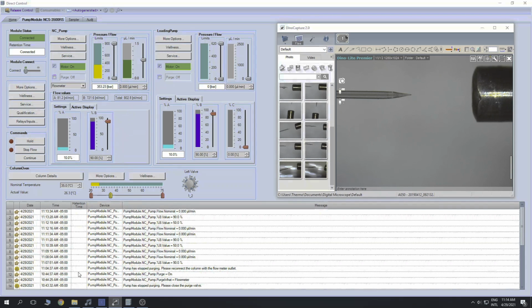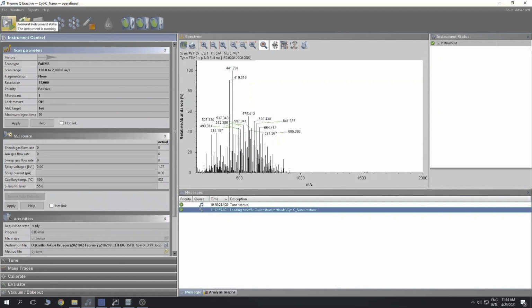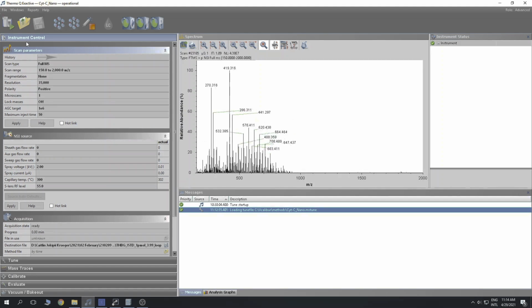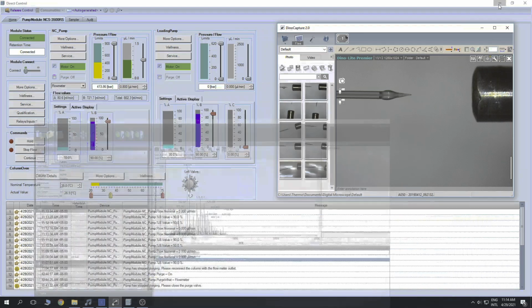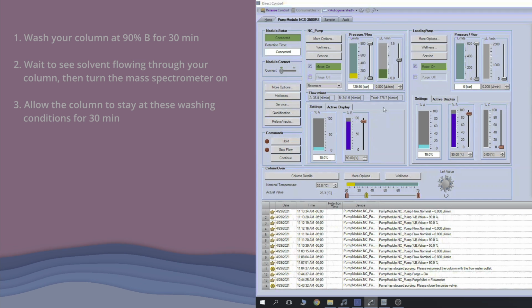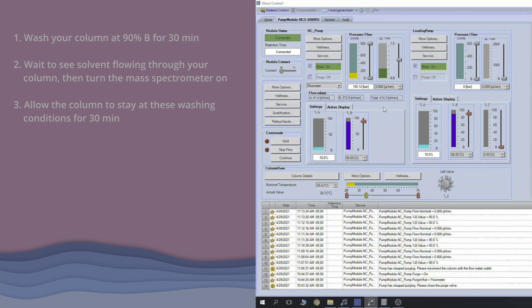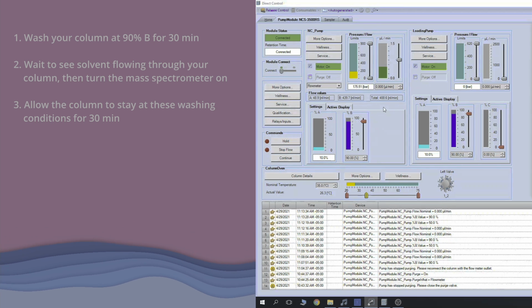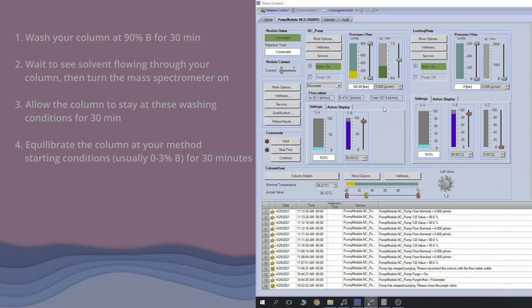To do that, we'll open this tune file, which looks like a music note, and click here from standby to on. And now you'll see that the droplet is no longer there. Once your column has gotten up to pressure, which as you can see, ours is not yet, you'll want to let it equilibrate for about 30 minutes at this 90% B.